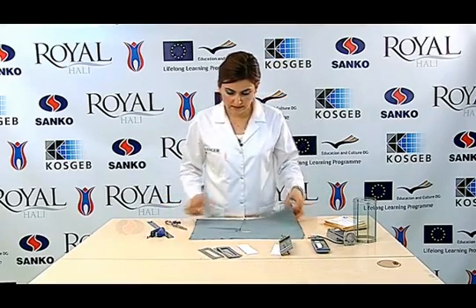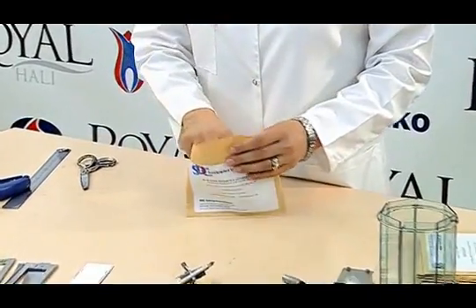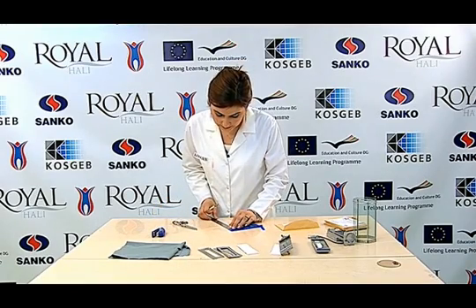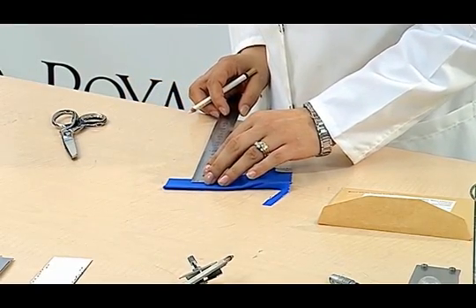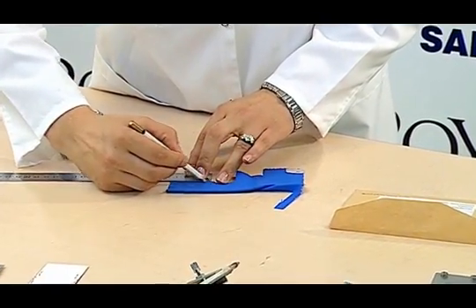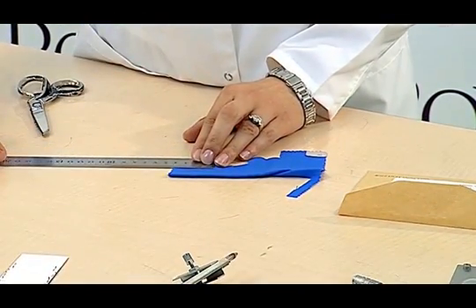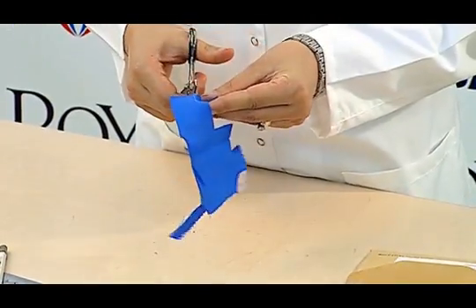To prepare the standard blue wool for the sample, we cut a sample of 1 cm by 4.5 cm from reference 1. We make sure that the size of the reference and the size of the prepared sample are the same, as the same size will facilitate the evaluation process. We cut the drawn sample along a straight line.